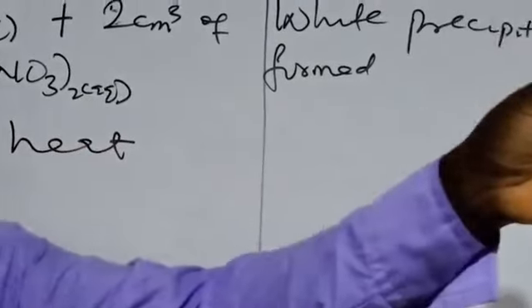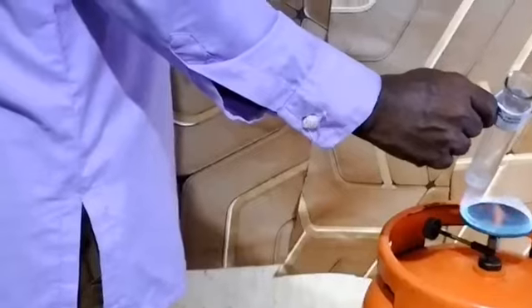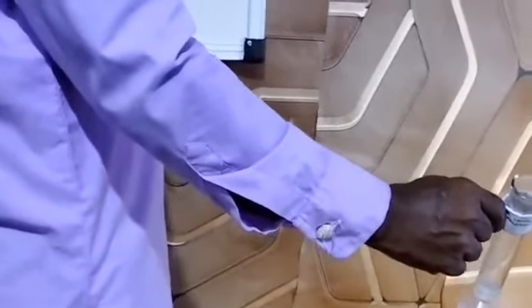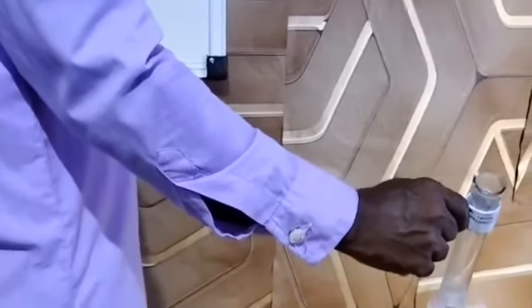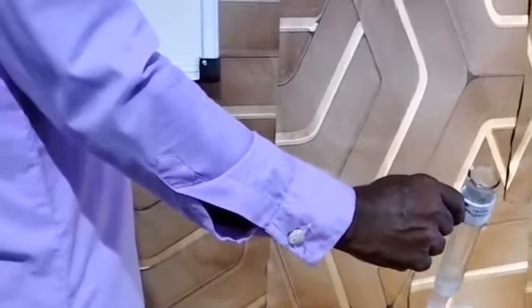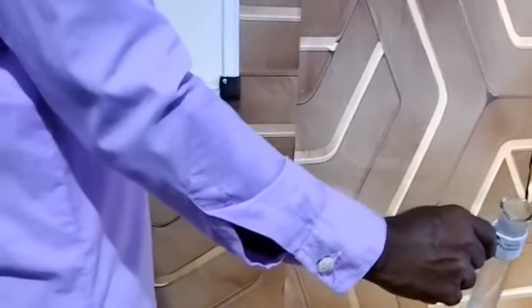So we're going to heat this white PPT that is formed over the Bunsen burner, to see whether it will dissolve or remain insoluble on heating.